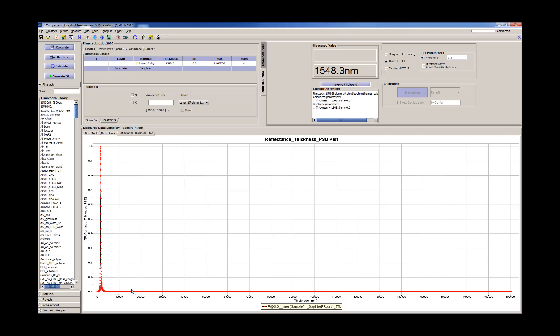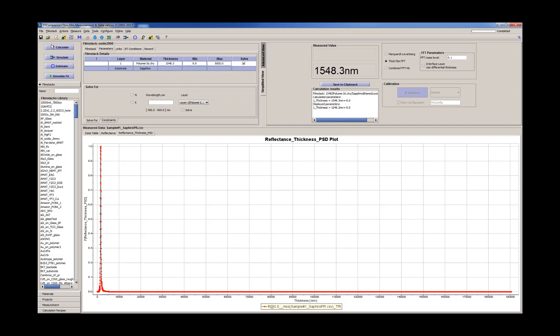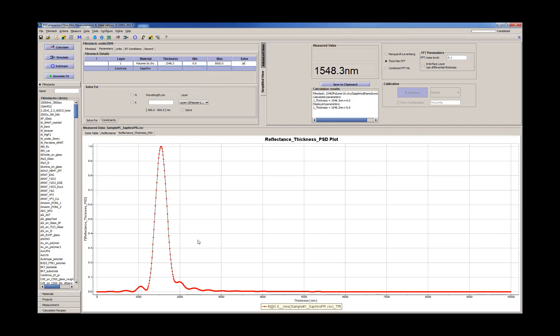So it's a little bit difficult to see, so we'll reduce the range to see it more clearly, let's say to 5 microns and recalculate. So we see it more clearly, the peak position indicates the thickness. But we know that optical constants of this polymer are probably not accurately representing photoresist.